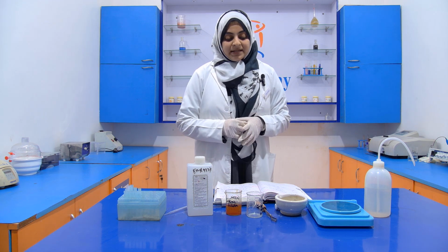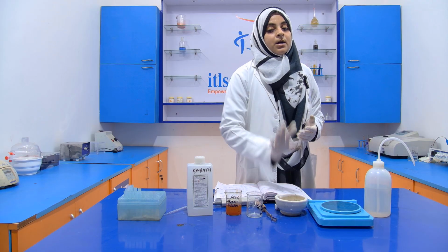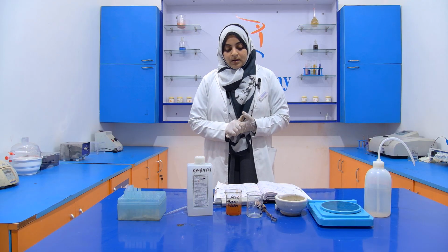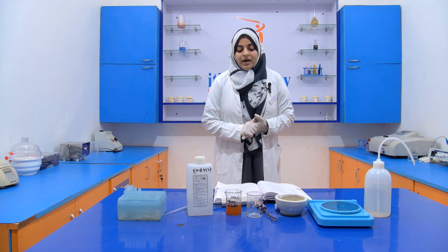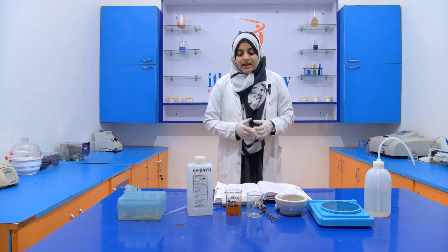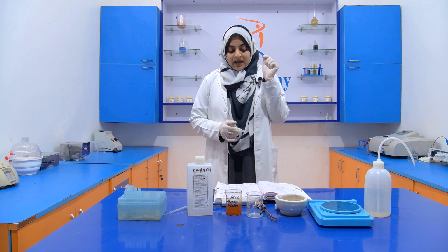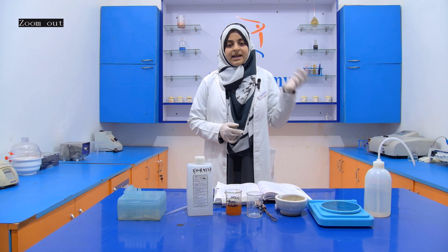Now for performing this experiment, first of all we have to take the weight of the black pepper. Then we add around 100 ml of ethyl alcohol and mix it. If our black pepper is mature, then it will sink.